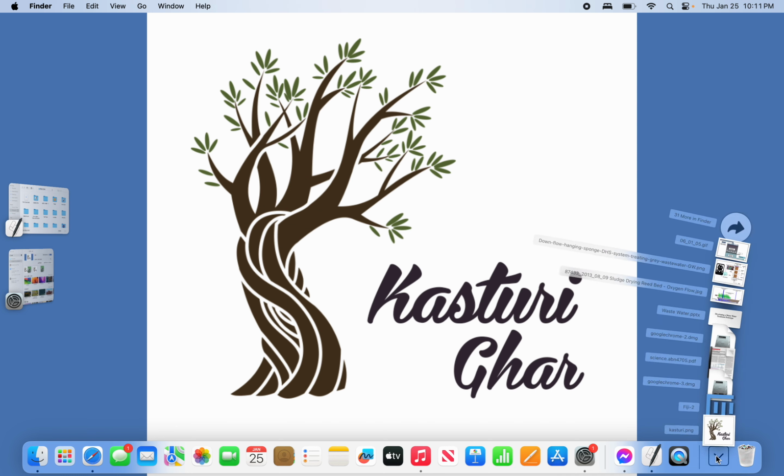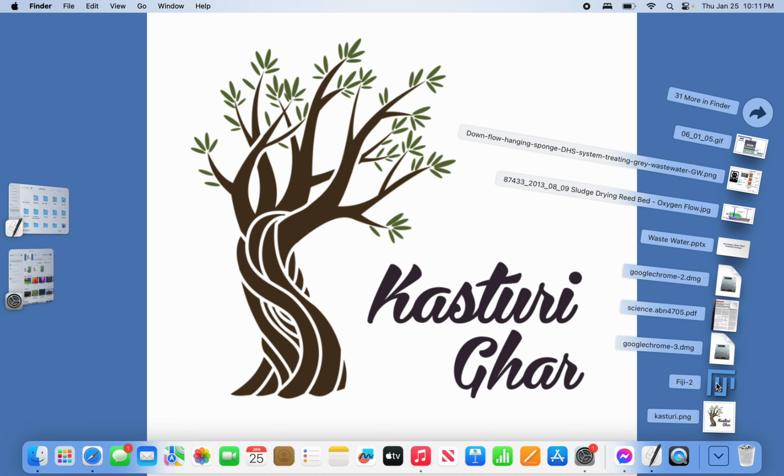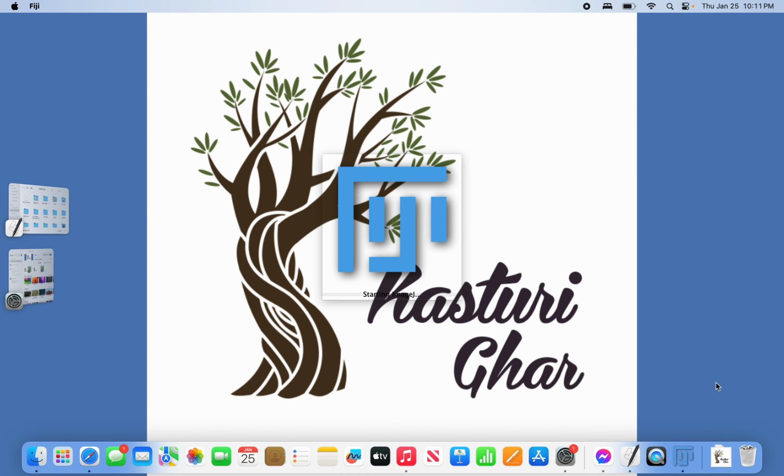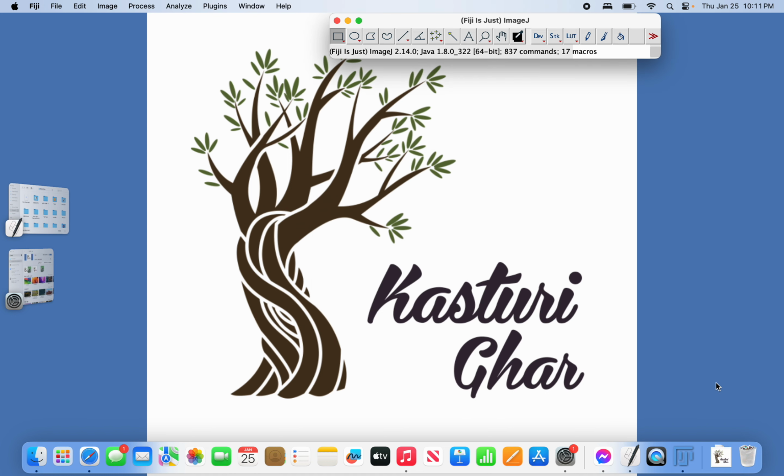Let's see. So we have already downloaded Fiji, which is an ImageJ version. You can download this as well, or just ImageJ. But I would prefer downloading Fiji ImageJ 2, which is more advanced and has more features. So now it's open here.